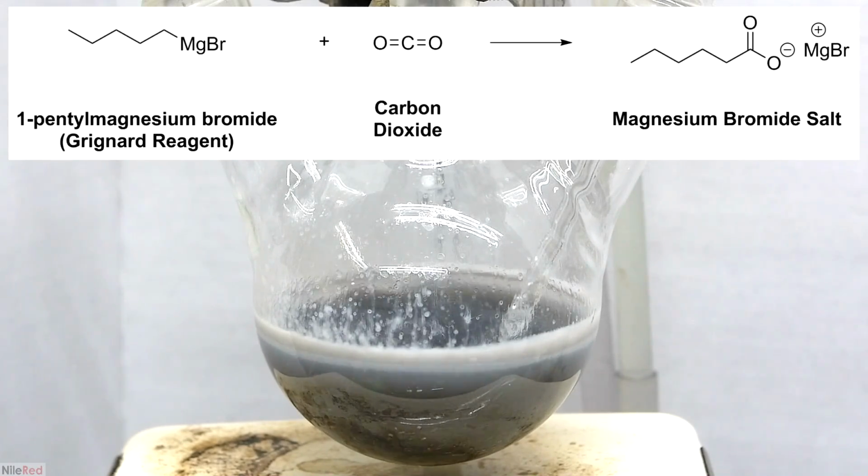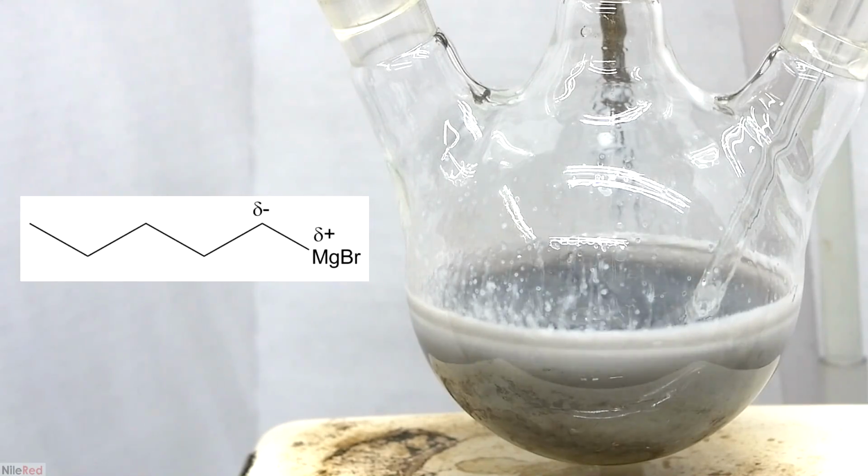The Grignard reagent that we made before reacts with CO2 to form the magnesium bromide salt of caproic acid. The salt is insoluble in ether, so it precipitates as the white solid you see on the sides of the flask. When we take a look at the Grignard reagent, we can see that the bond between the carbon and the magnesium is polarized. The electrons in the bond lie much closer to the carbon, so there's a partial negative charge on the carbon and a partial positive charge on the magnesium.